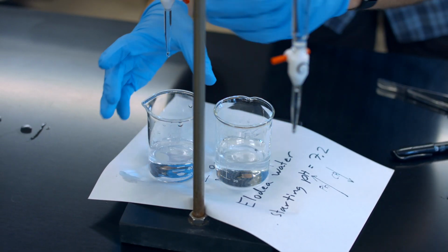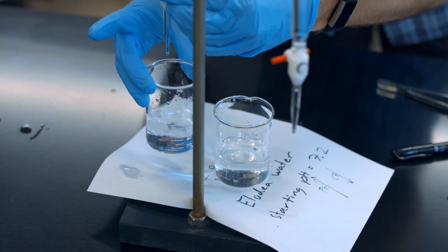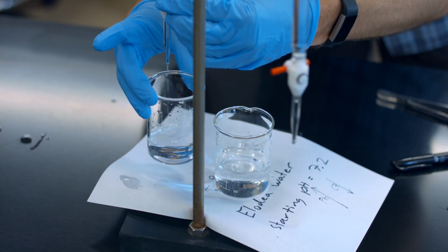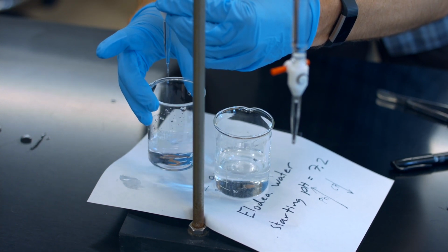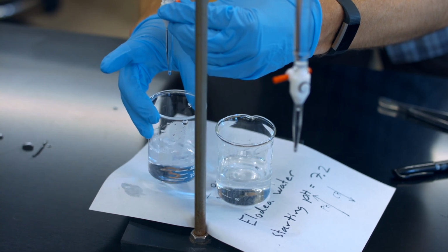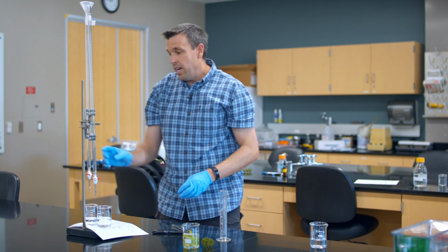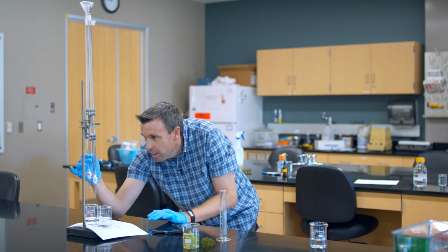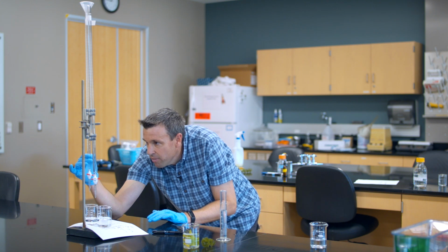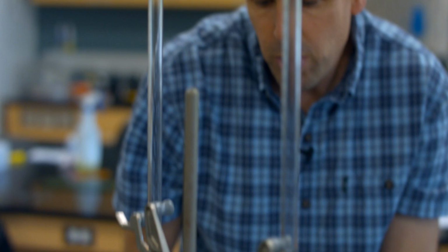And so as long as you're consistent in titrating all of them, we can go a little bit further and see if this gets a little bit more pink, but you want to make sure you are really careful and get right to that subtle pink color because that's how much it took to get to 8.2. But I'm just going to leave it at that at the moment. So now I would just find the final volume. So we're now at 48.5. 48.5 minus 30.5, we know that that took 18 mils of titration.